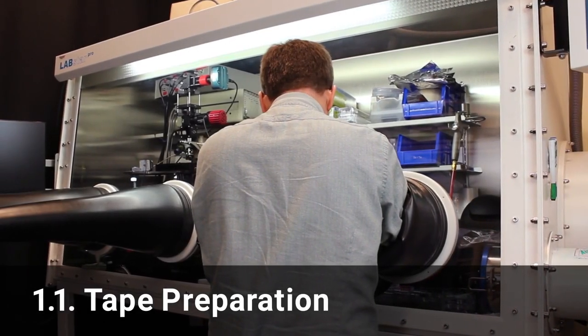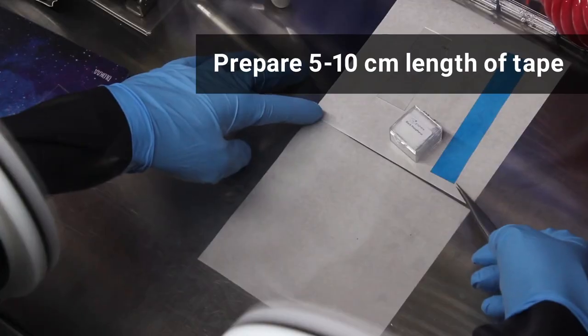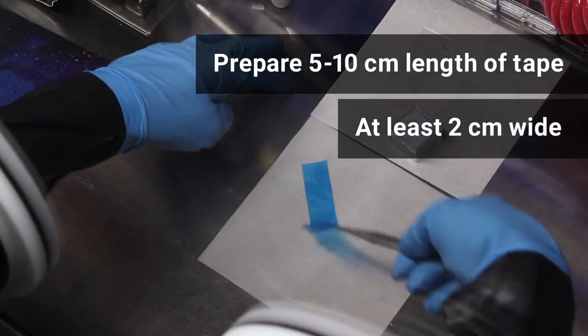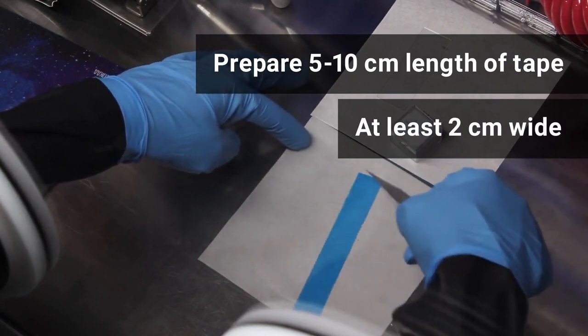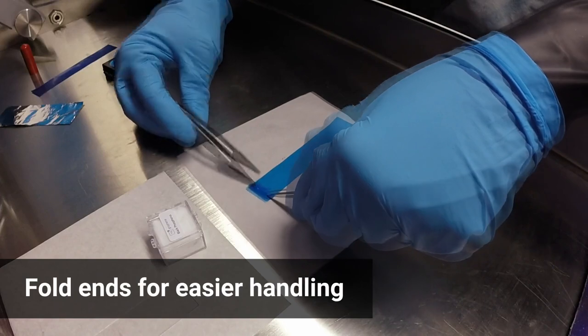Working inside a glove box, prepare a length of tape that is about 5 to 10 cm long and at least 2 cm wide. Place it sticky side up on the working area. Fold up the ends to make it easier to handle.